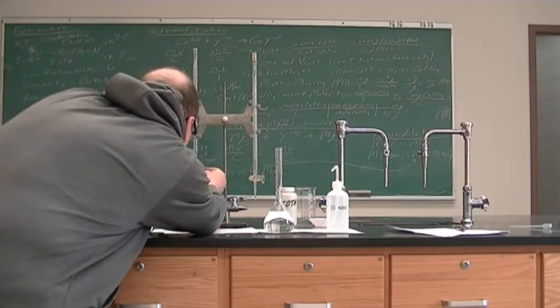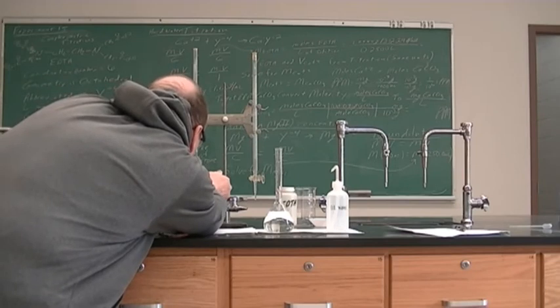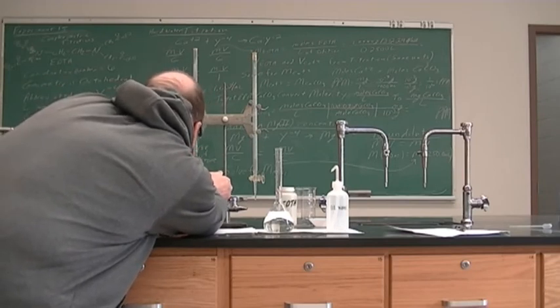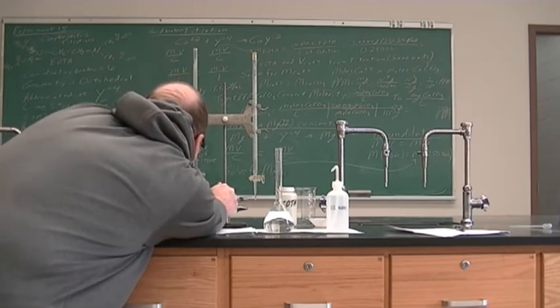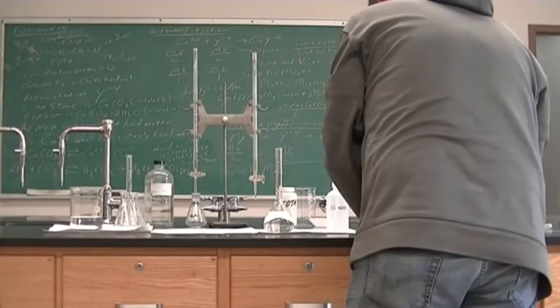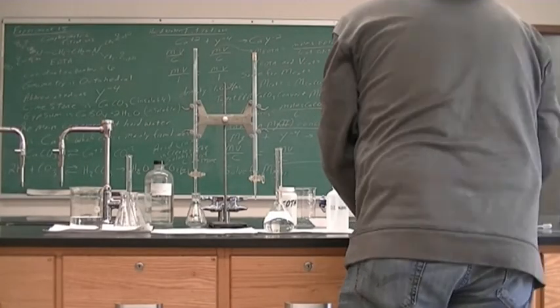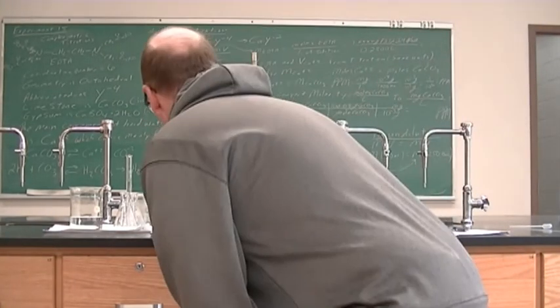All right, so it is now at 22.95. All right, so about 22.5 mils in there.